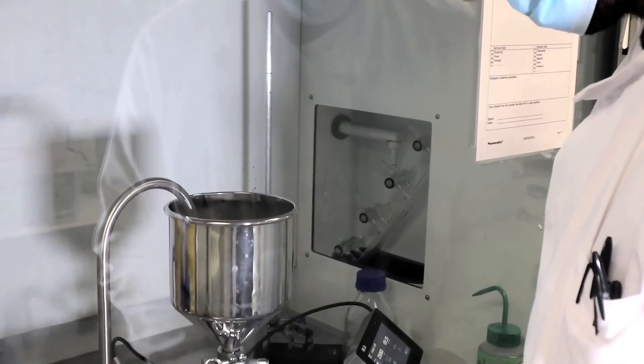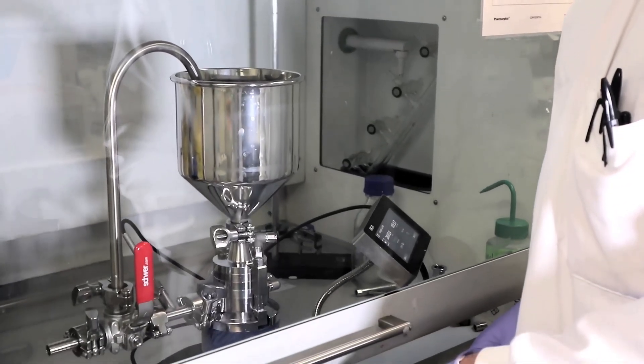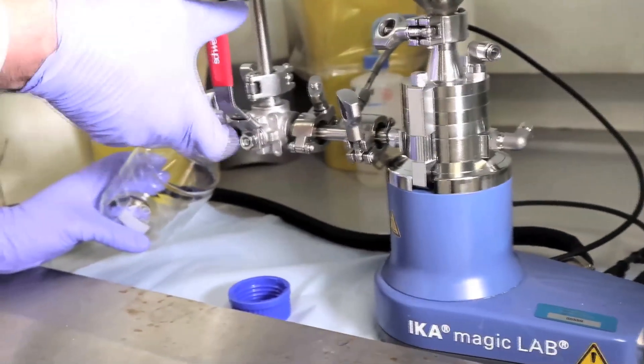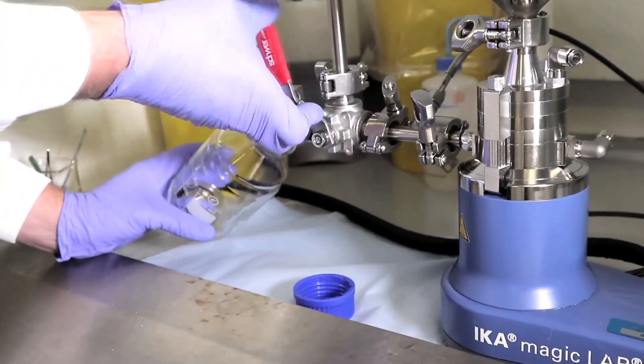Wet milling is a technique which uses a solid suspension as input material which is passed repeatedly through sets of rotor blades to reduce particle sizes to between 20 and 200 microns.